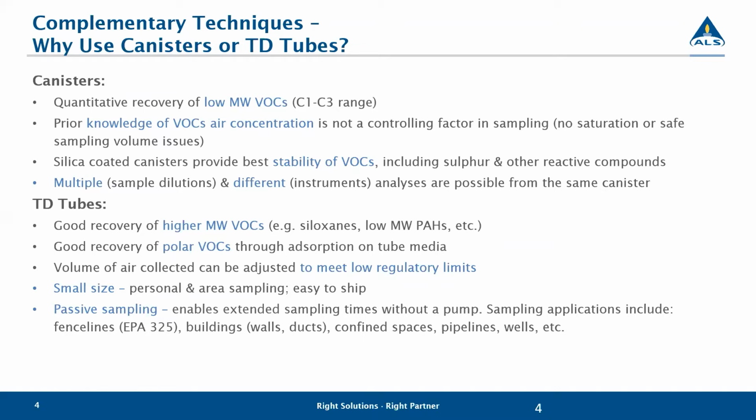lab looks at PSI. So if perhaps you end up getting an email from one of the techs because it's been forwarded from one of our account managers, please feel free to message me back or message our lab manager back, Andrea Armstrong, and we can do the conversion calculation to let you know where we're at as far as inches of mercury, because I know on your documentation that would likely make more sense. But never be worried that there's some sort of a problem as far as the conversion. We can do that for you. We're happy to provide that. I'm also happy to provide the calculation if you'd like to keep it in hand.